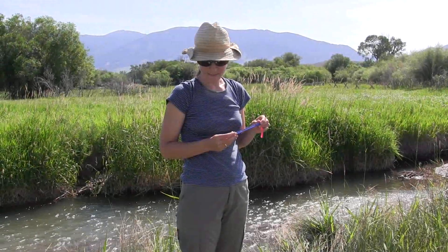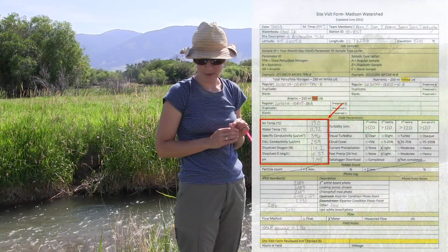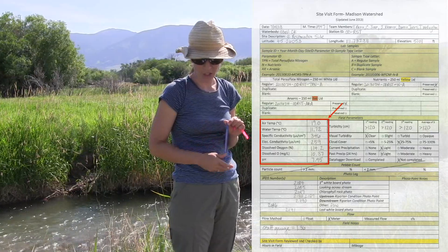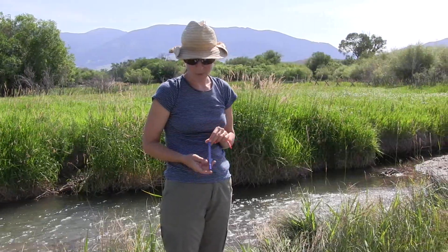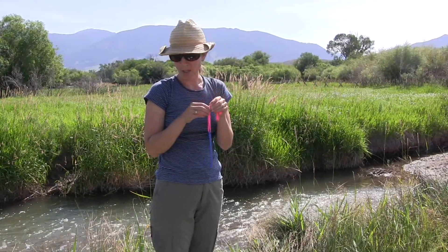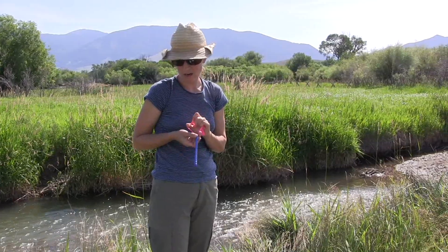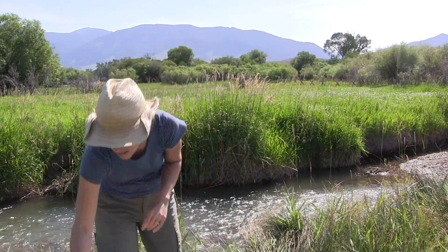To take field parameters, which are listed down the left-hand side about halfway down your site visit sheet, the first step is to find your air temperature thermometer and place it somewhere in the shade so that it can settle in on a reading.